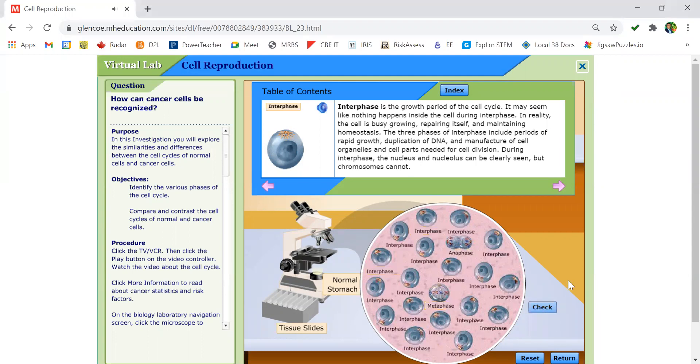Pause the video now to record the number of cells in interphase and the four stages of the cell cycle.